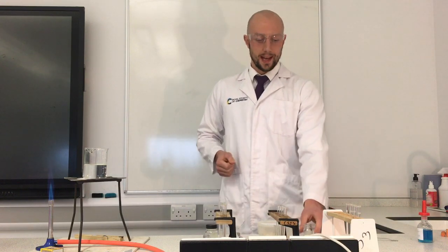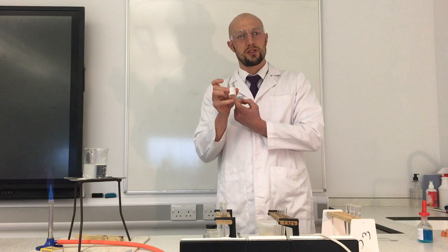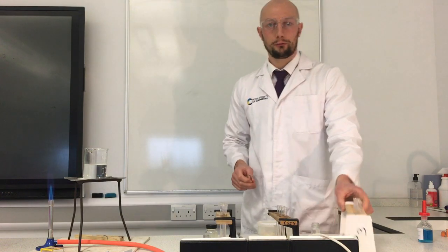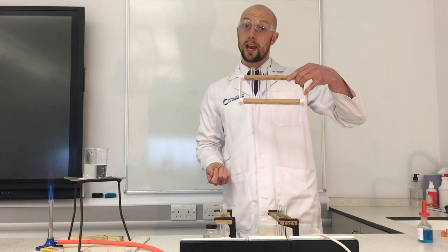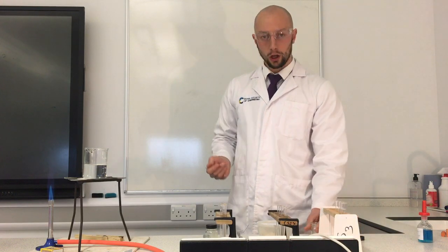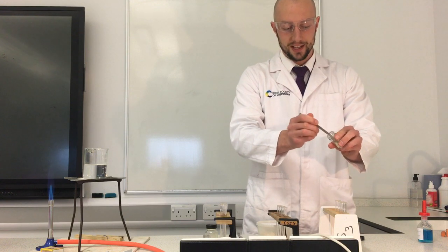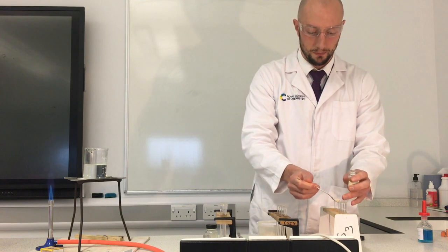First, I'm going to test some energy drink powder. So this might be what you'd use to make Lucozade or Gatorade. I've got 3 test tubes. We use these in a science lab to do reactions in. I'm going to take my energy drink powder, get some on my spatula and put a bit into each of my 3 test tubes.